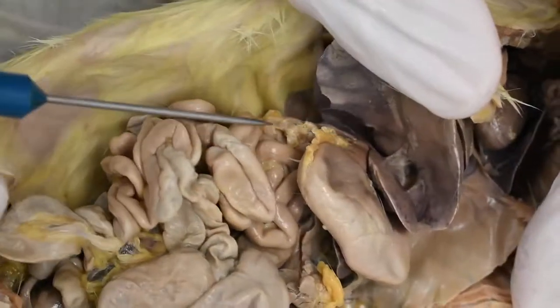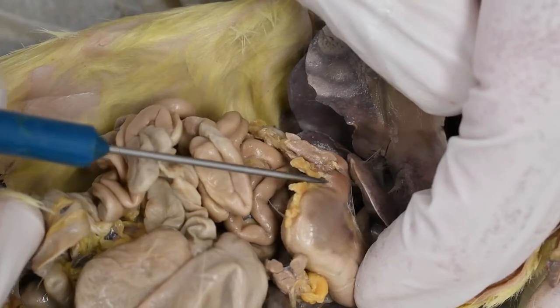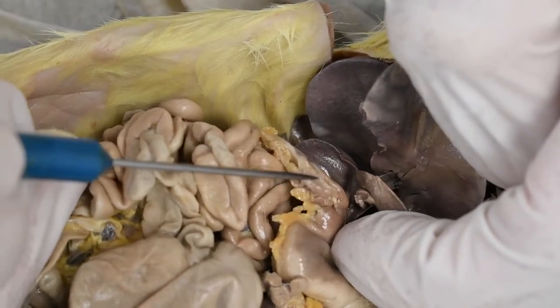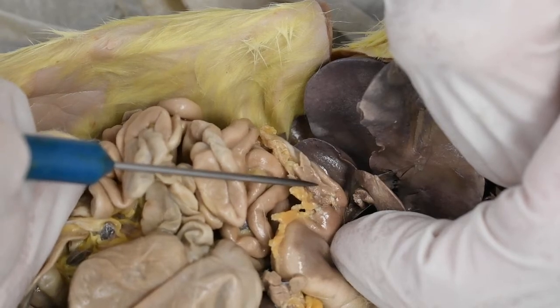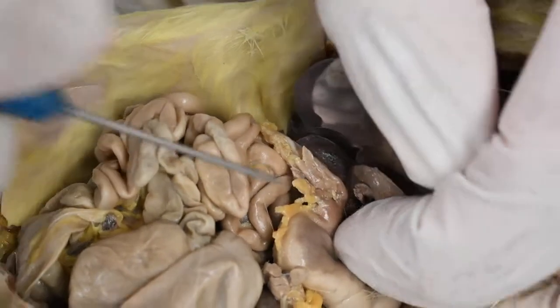Now, we should be able to find the pylorus here. Yes, so notice there's a little constriction right there. That's where the pylorus is located. Now, right there, sitting in the same location as it is in a shark and a frog, we have the pancreas. Remember, the pancreas makes enzymes that it dumps into the beginning of the small intestine.